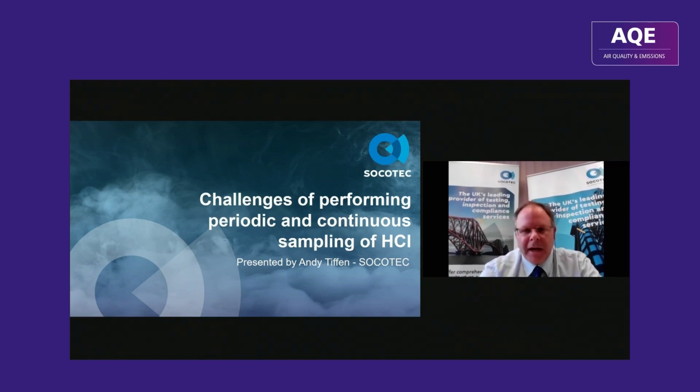I'm going to be talking about basically the challenges of performing testing for HCl, both from the point of view of a test house performing the standard reference method testing, and a little bit on the challenges that the CEM system sees as well.